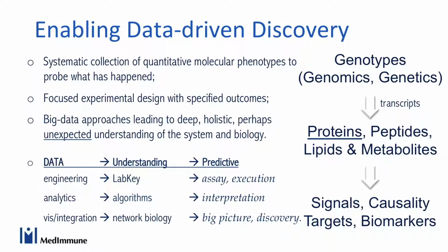We want to do a lot of molecular profiling, so we can understand the relationship between the genotype, which comes from genomic efforts and genetics, and the measurements of proteins and peptides, to understand how these entities actually drive the target, the biomarkers, et cetera. When I look at this approach, I can see there are some very critical components that will be necessary in order to do this.